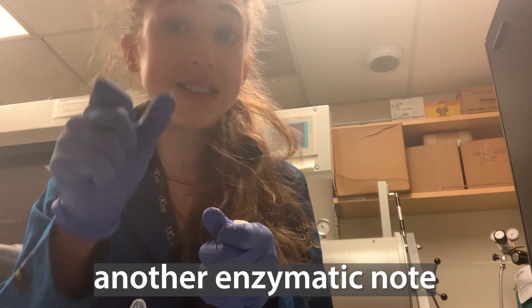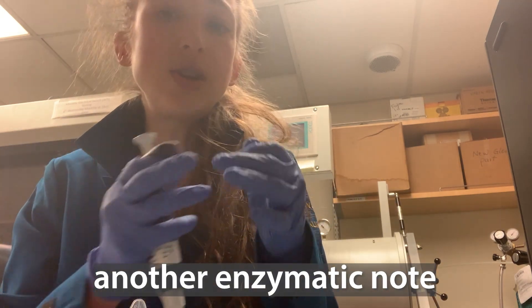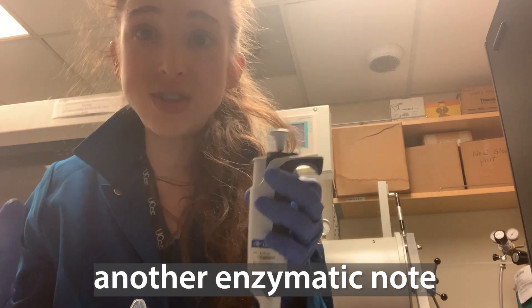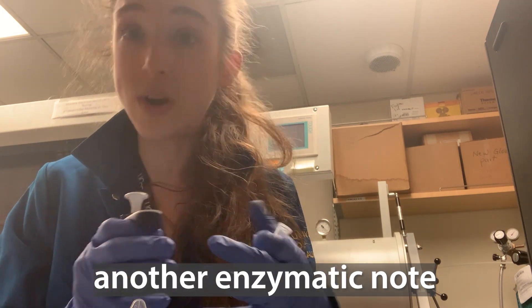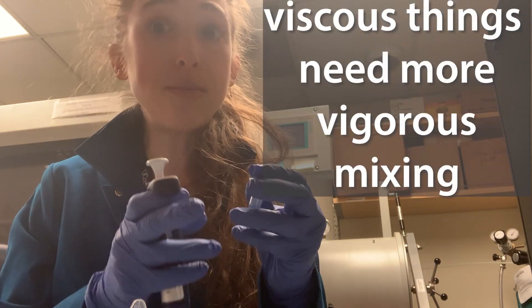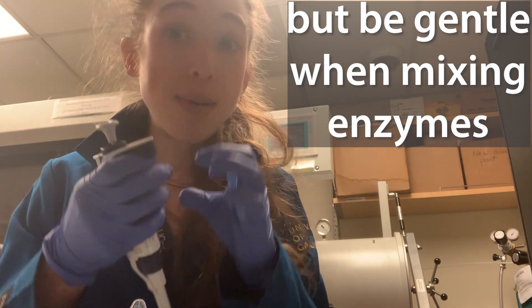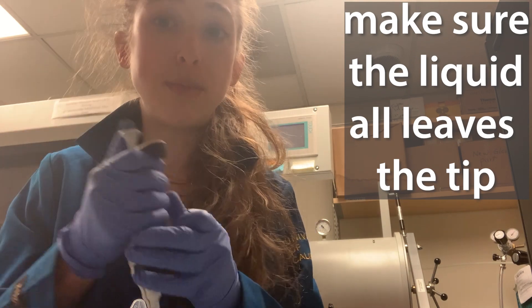A lot of times the thing that you're pipetting is going to be a small volume into a big volume, such as when you're working with an enzyme. You set up your whole master mix of reactions, you've got everything going, and then you add the enzyme last — so that it doesn't start working when you don't want it to, or so that it gets into a nice, perfect environment when you're ready. You're pipetting this tiny volume of a really viscous thing into your solution, so remember it's going to need that mixing. But remember to be gentle. When you're pipetting that small volume into the big volume, make sure that it all goes out of your tip and keep your thumb firmly pressed when you're pulling out.